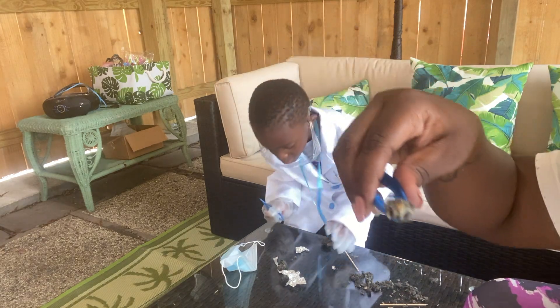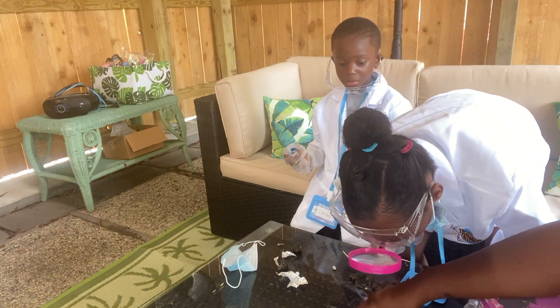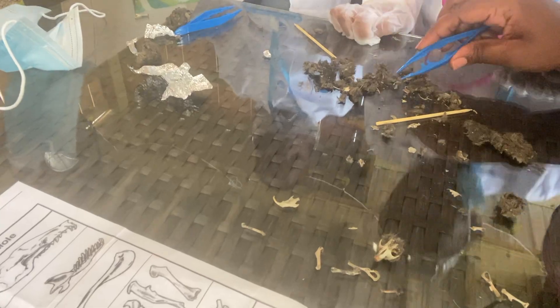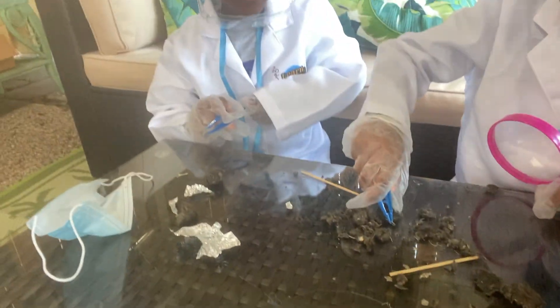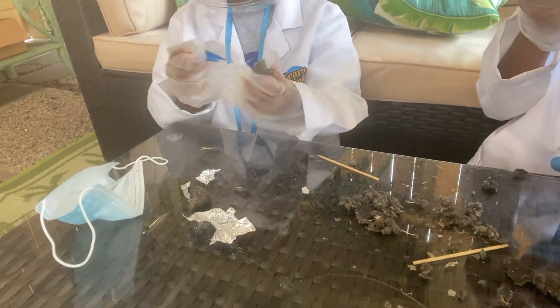Wow. Just so y'all can see that tooth again — look at this rodent, see the front teeth? All right, so we're going to clear all the teeth out. See all this hair? Look, you got another bone. Carmela, you got a lot of your pellet still together. I found my bones. You got a lot more bones. Your pellet is still all together, so let's break that up and see what we've got.